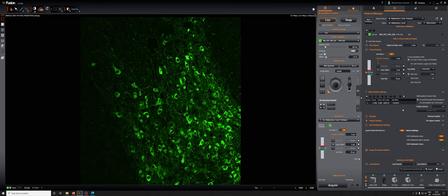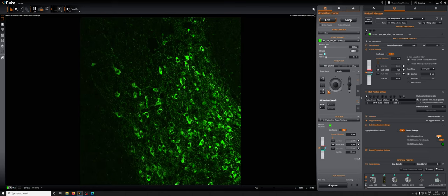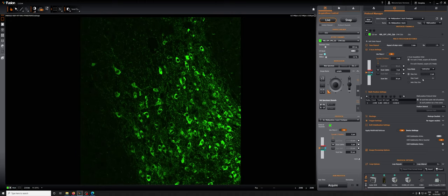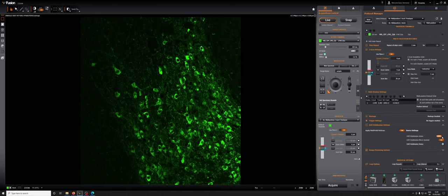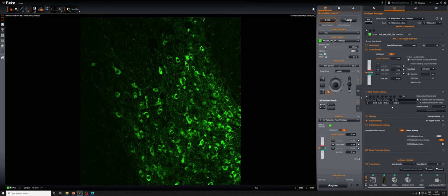Immediately after we add the point, we will turn drift stabilization active to the off position. If we had been in the start end type of design, we would want to make sure that the piezo is situated in the start position, then we apply drift stabilization active, and then we add the point to the multi-position setting.